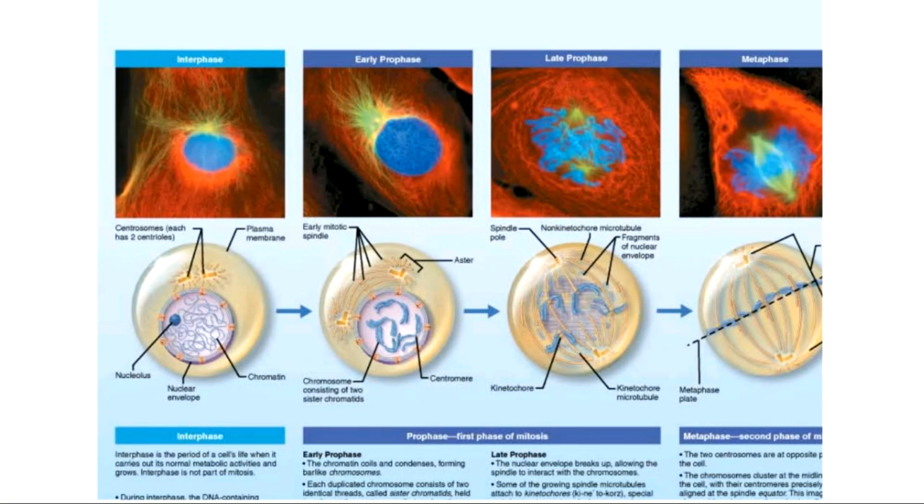So here's that first part of the pictures. Again, in the guided lesson, you've got these. So first thing we'll mention on our picture here, interphase. Remember, interphase is not part of mitosis, so the cell is not dividing. All the cell is doing right now when it's in interphase is it's growing and it's copying its genetic information.